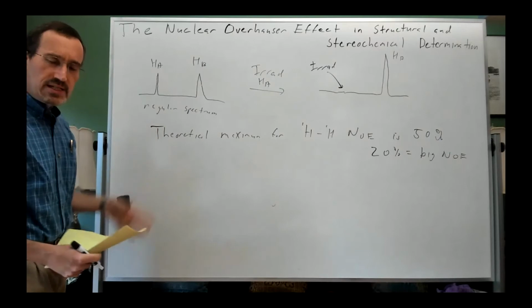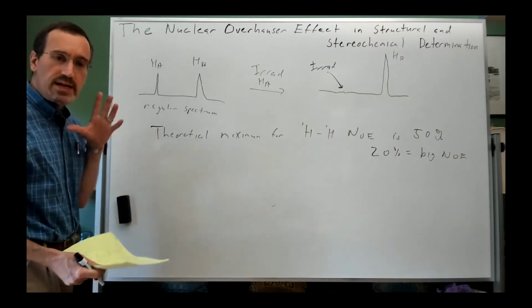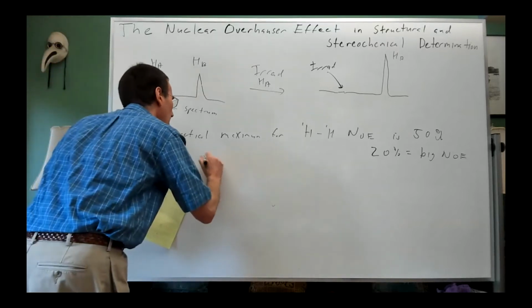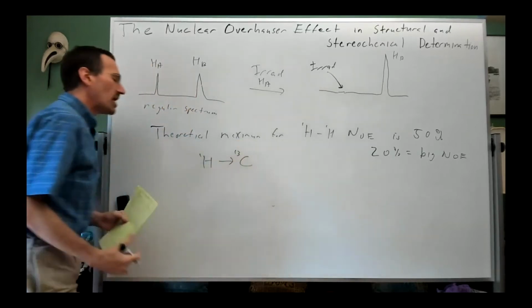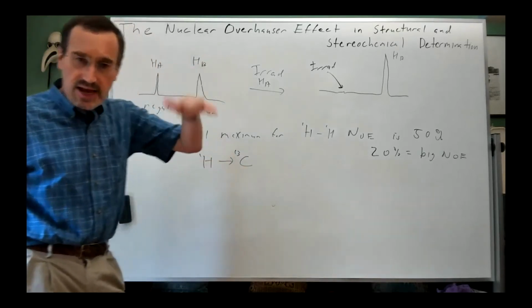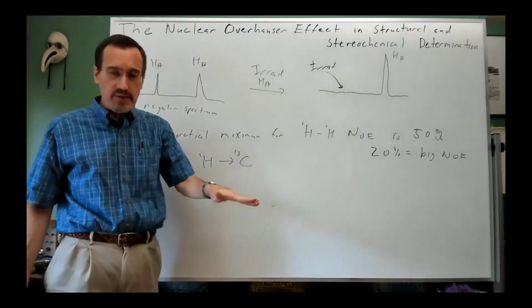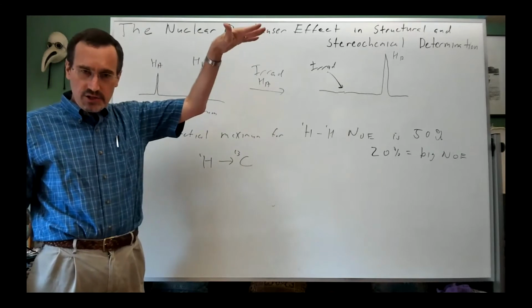But in every C13 NMR spectrum we're running, it's with proton decoupling. And I've already talked about NOEs, and I mentioned that the carbons to which hydrogens are attached are usually bigger. And you've seen that, right? The quat carbons are typically very small in the carbon NMR. The signals from them are very short. The CHs are much taller.